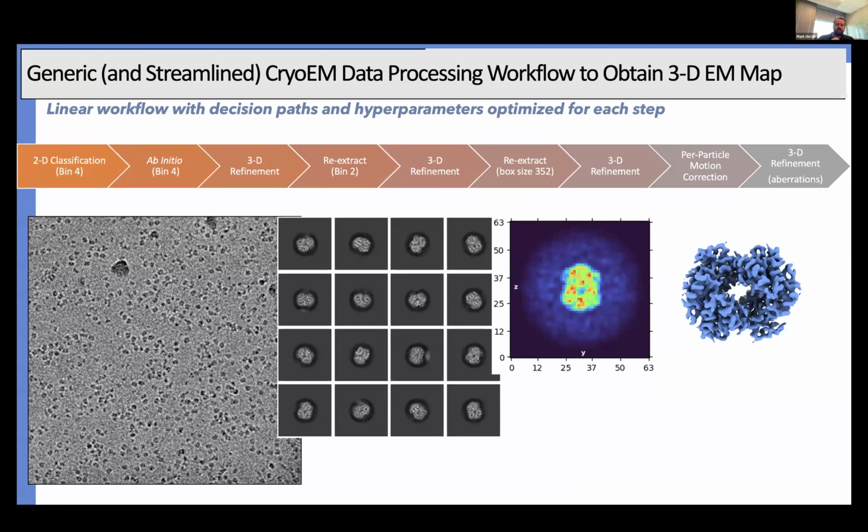Right. So the workflow for cryoEM is something that we like to distill down into this very linear workflow. It's very simplistic, ranging all the way from looking at your raw micrographs, 2D classification. Some people skip this for some reason, but in general, moving then into 3D. And I would say that this is by far one of the most subjective decision-making processes you have. There's tons of hyperparameters that go into this. There's tons of workshops that are oriented around how to best approach this.